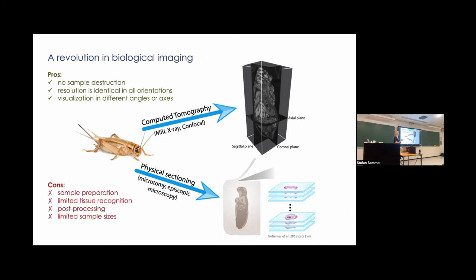But there's still challenges, and we've touched on a lot of these, and you probably know. It still involves some sample preparation, and if you work on dead, floppy, wet things, that preparation becomes really, really important. These things have to stay still while they're being digitized. It's a big jump above what we used to do, which was something like serial grinding, and museums don't really like when you cut things apart. So again, there's a big benefit.